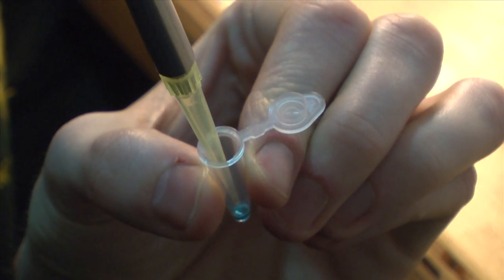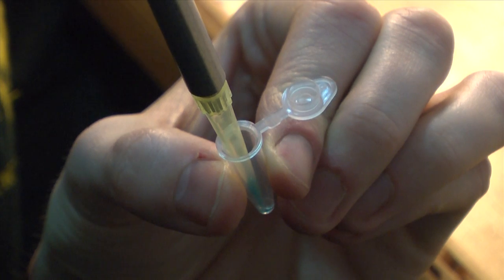It hasn't got any settings, that's just like, you plug it in and say, okay. Do you have any idea what the current was on the other one? No idea, we've never measured it.